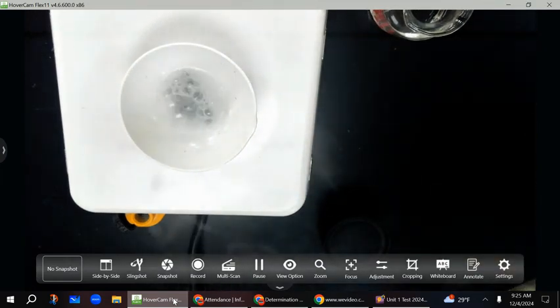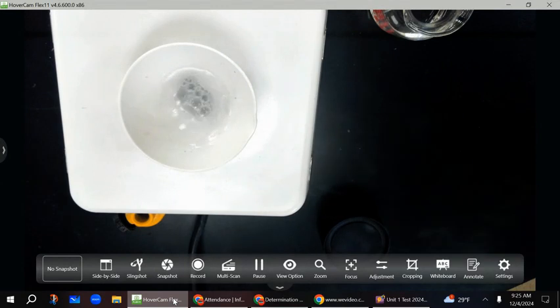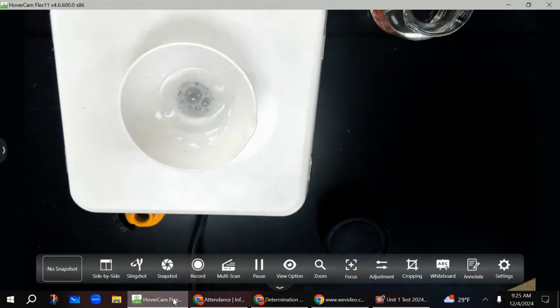Add more acid. Now, here is the catch to this part. When you start getting less and less zinc in there, when you don't see it as much, then, ladies and gentlemen, you need to add the acid a little bit more slowly. Because eventually I need to boil off all of the extra acid and water that is in there. So the more I put in, the longer it's going to take to boil off. Okay? I don't want that to happen.